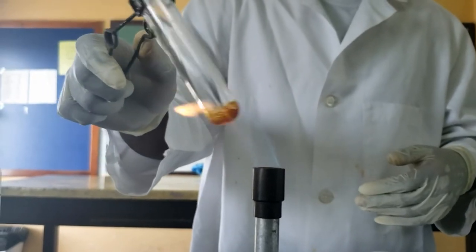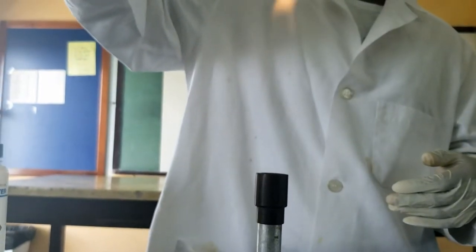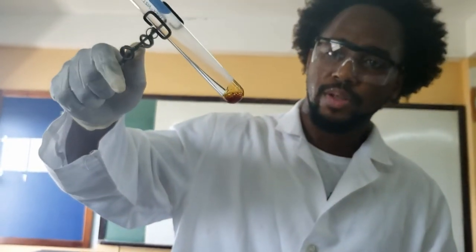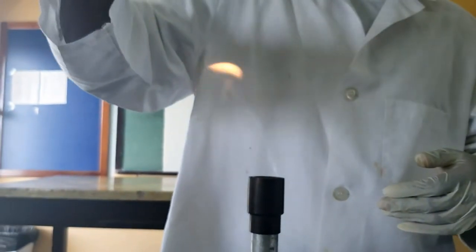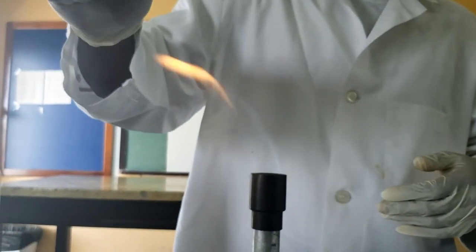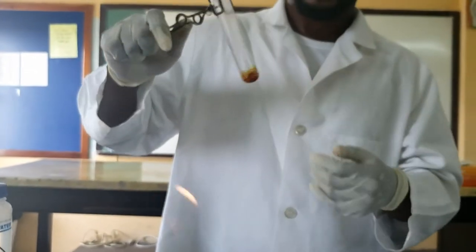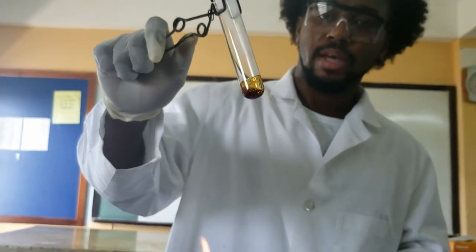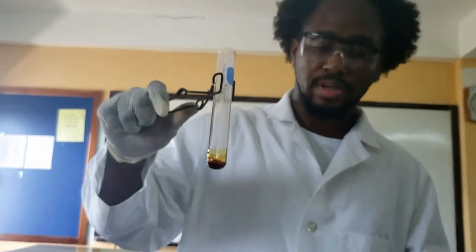Continue heating, and once it gets brown and fully molten, we are going to stop right there. Because if we go any further, the sugar will then be completely dehydrated — it will combust and it will stain the tube black. So this is as far as we go. Any more burning, we will just completely burn out the sugar and it will stain the tube black and be harder for us to clean. So we are going to stop here and turn that off.